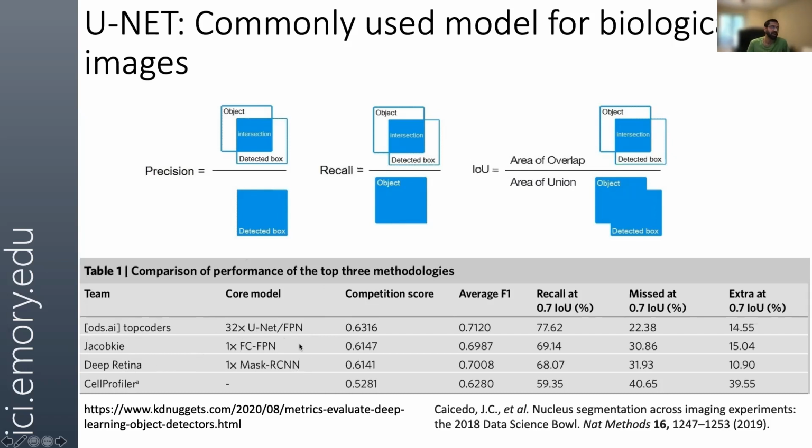However, what was realized in this competition is that these models are not amenable for people to use routinely because they don't have crazy computational power. Within these few years, from 2018 till now, a lot of groups have come up with models which let you work in a very efficient manner without a lot of GPU power. And that's something that we will be using today, for example StarDist as well as Cellpose, right? StarDist and Cellpose really came after this paper was published, all right?